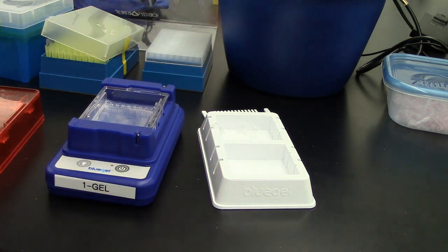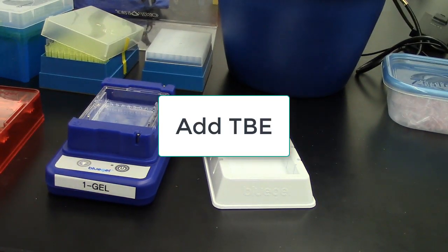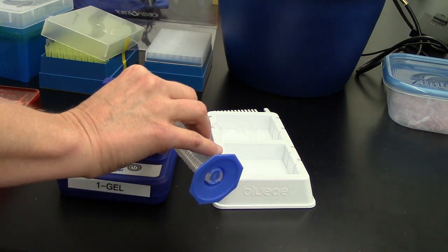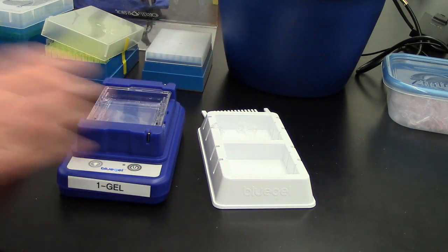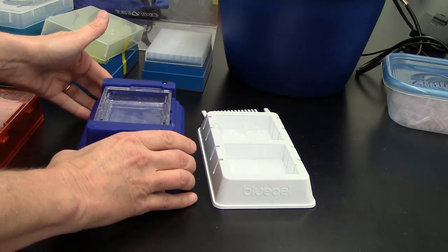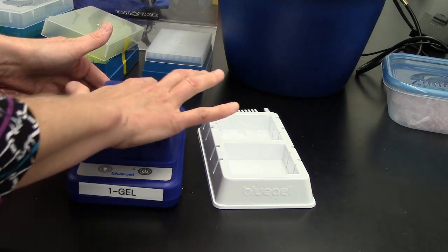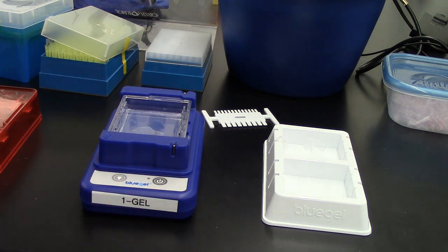Now you're ready to add TBE onto this. I'm going to add 25 milliliters of 1X TBE into the electrophoresis chamber. I'm going to rock it a little bit to make sure the entire gel is covered and all the wells are covered. Now we're ready to load our samples.